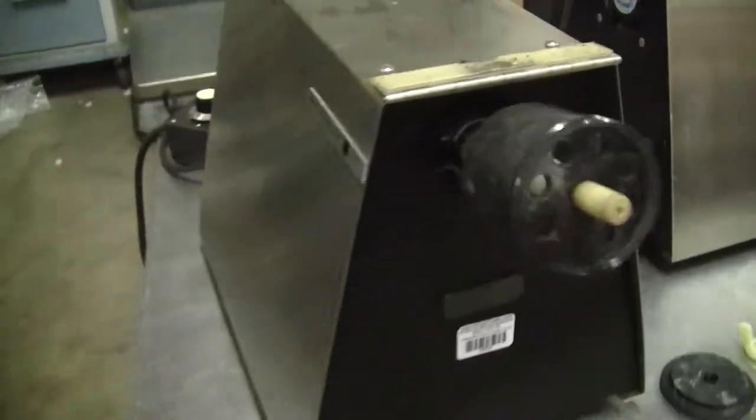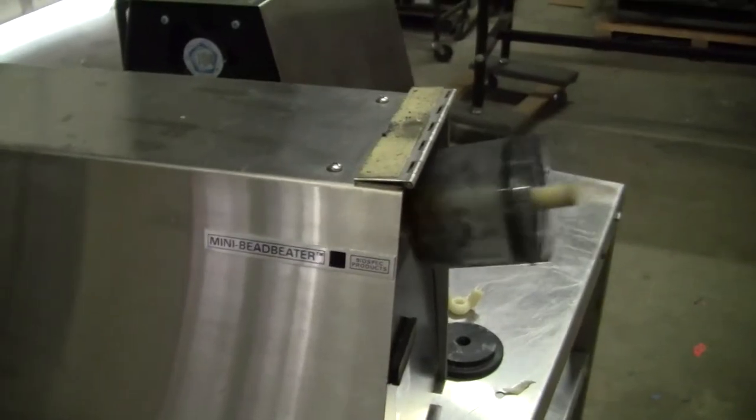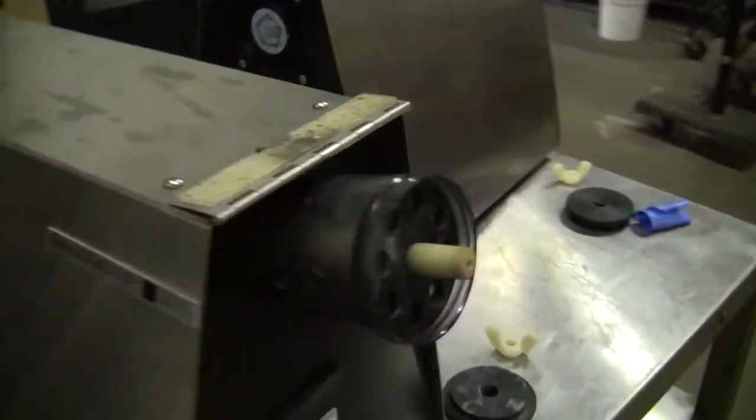Hi, this is Michael Nathau from Hi-Tech Fitter. Today we're looking at a Mini-BeadBeater, a BioSpec.